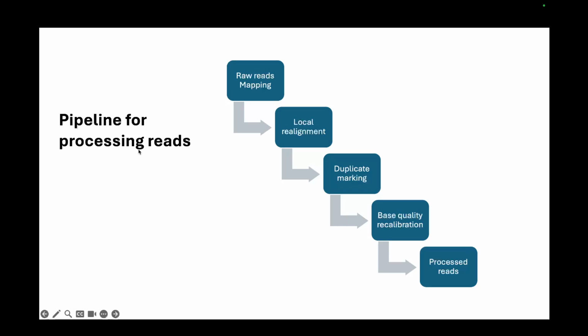This part of the pipeline is basically processing of the data post alignment. Before this, there will be the alignment. Before alignment, there will also be some sort of pre-processing, as we saw with FastQC. You will see what kind of reads are there and what the different caveats of the data are. After that, you'll align the data, and after alignment, this is the post alignment workflow.